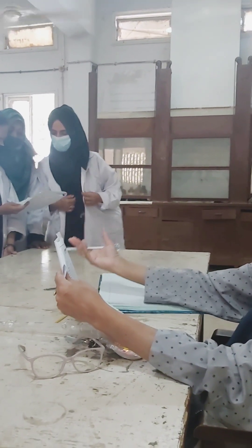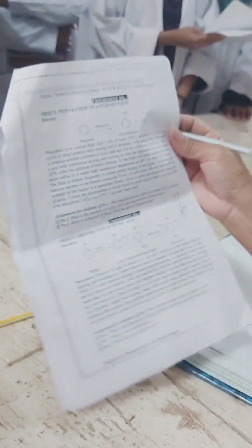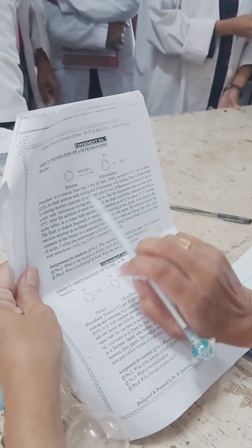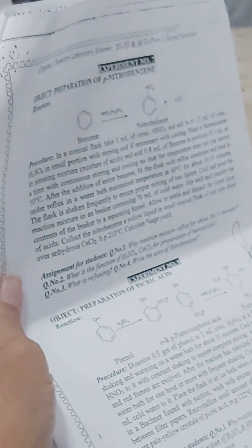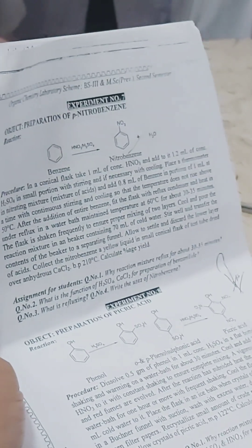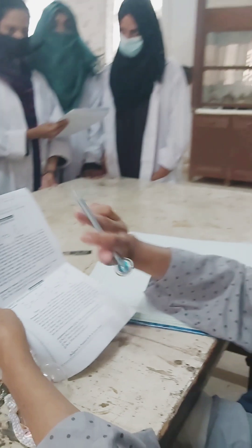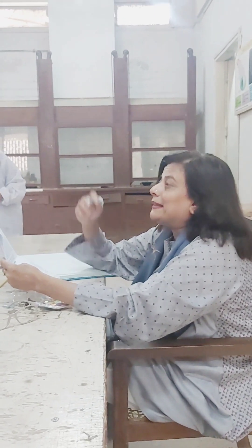In a conical flask or a round-bottom flask — you can use either — you will add 1 ml of concentrated nitric acid and 1 to 2 ml of sulfuric acid in small portions with constant stirring. The acids are always added in a dropwise manner, with cooling if necessary, as I have been repeating in every experiment.